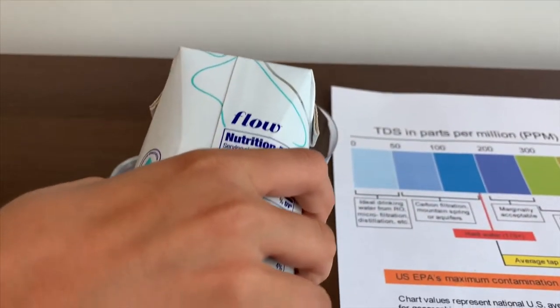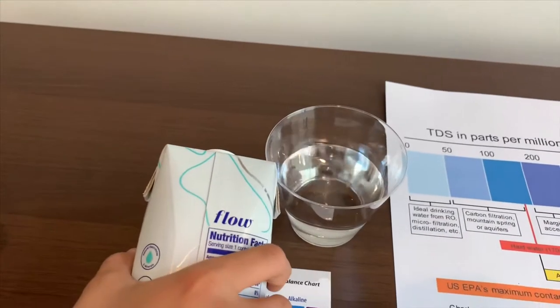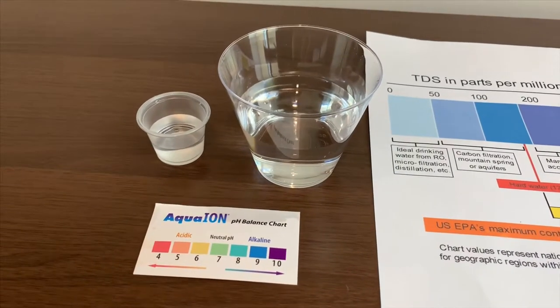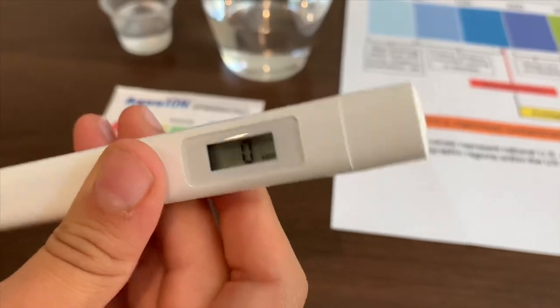Let's pour some water in. First, we're going to test the TDS level, then the pH. Turn on the TDS meter and make sure it says 0.